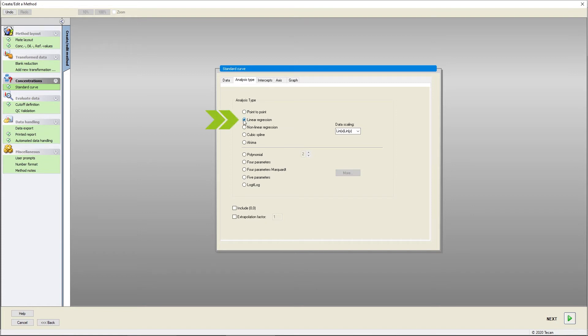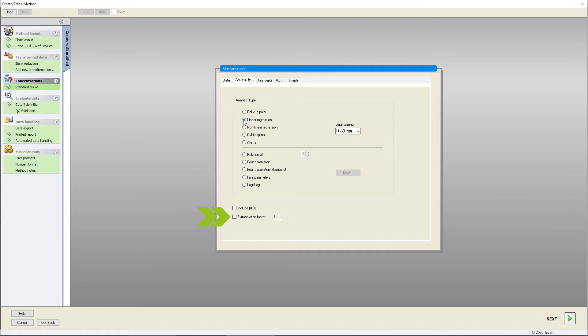In most cases, the assay protocol will advise which analysis type should be chosen. Choose an extrapolation factor to prevent values lying outside of the standard curve, which will extend the standard curve based on the given standard points.